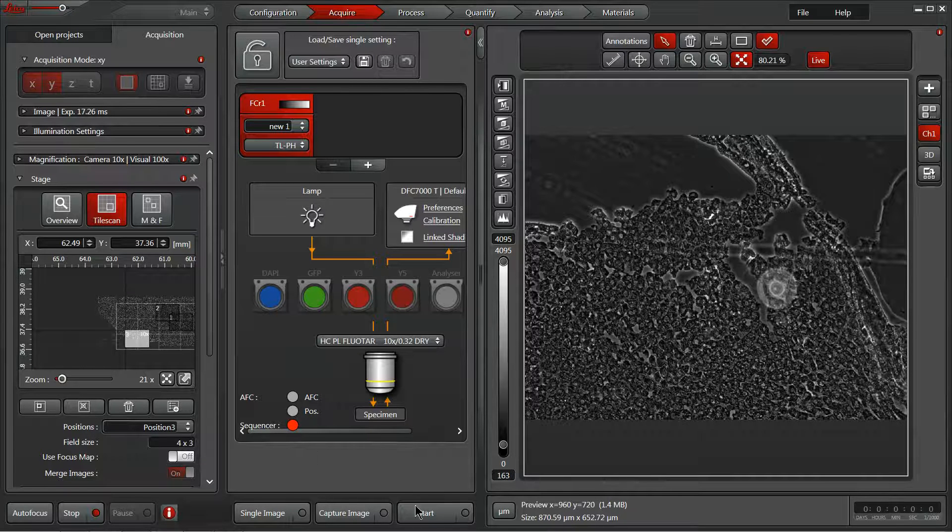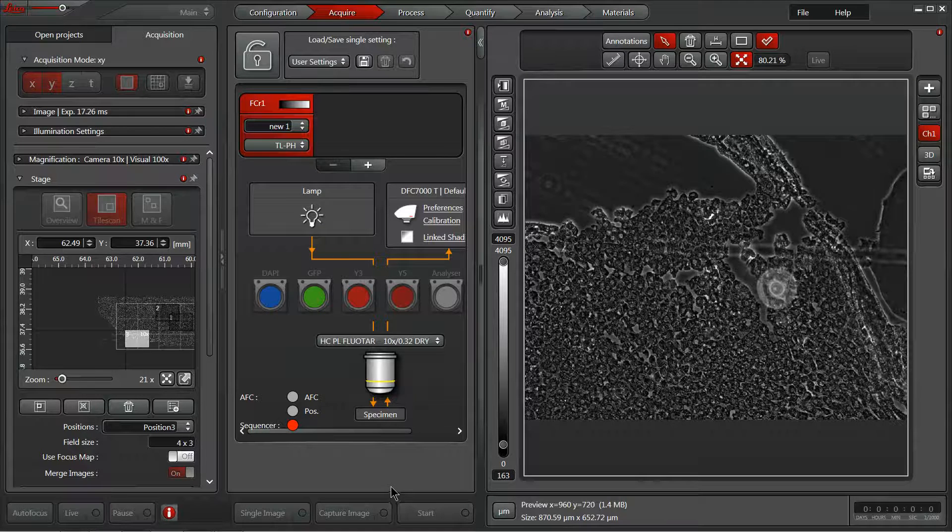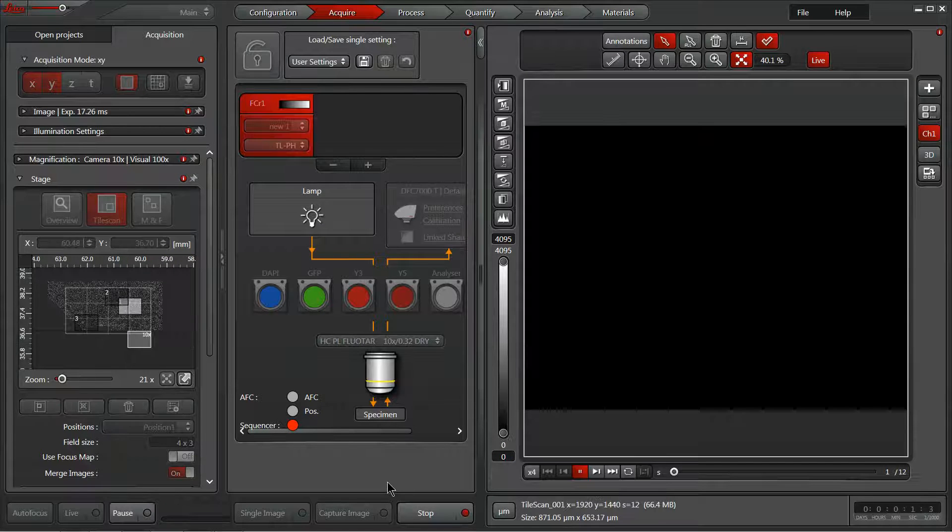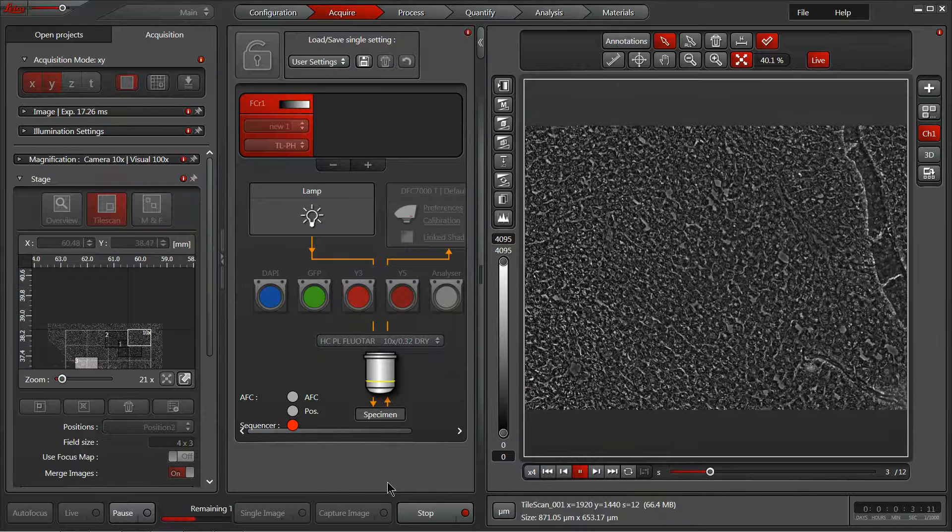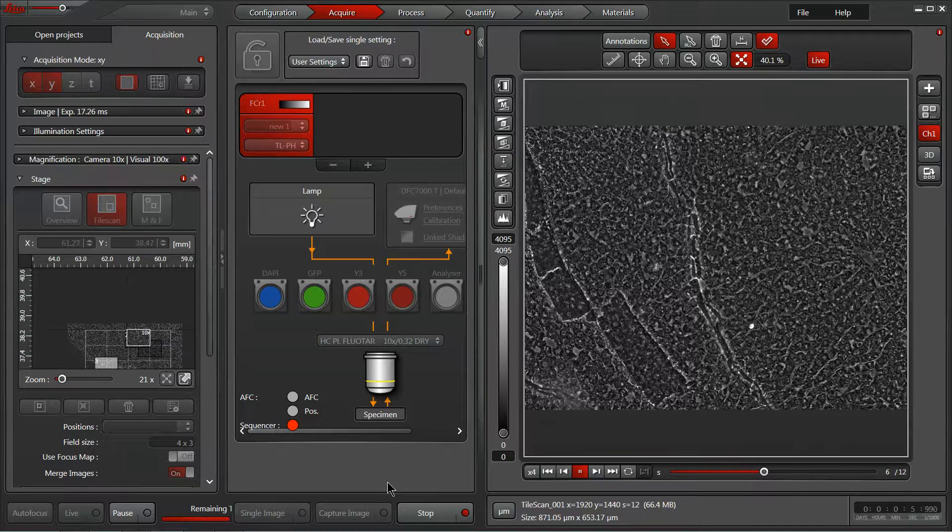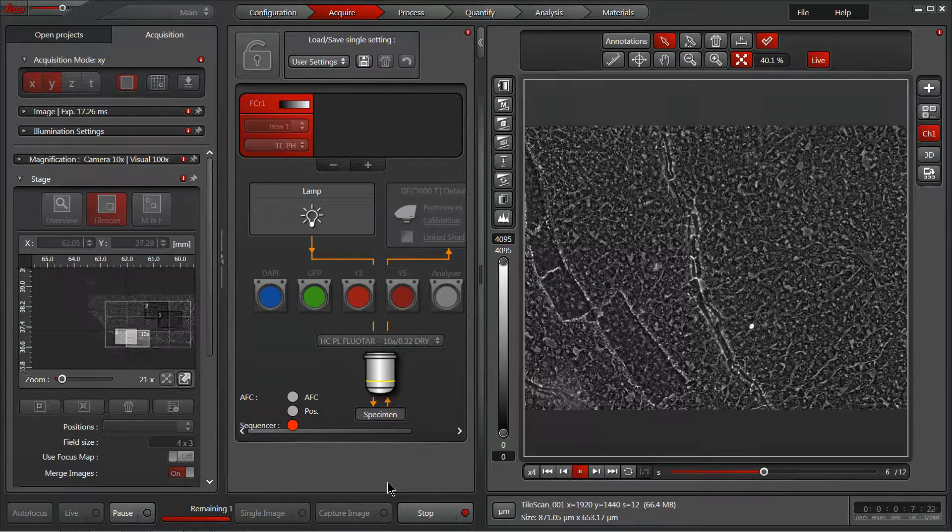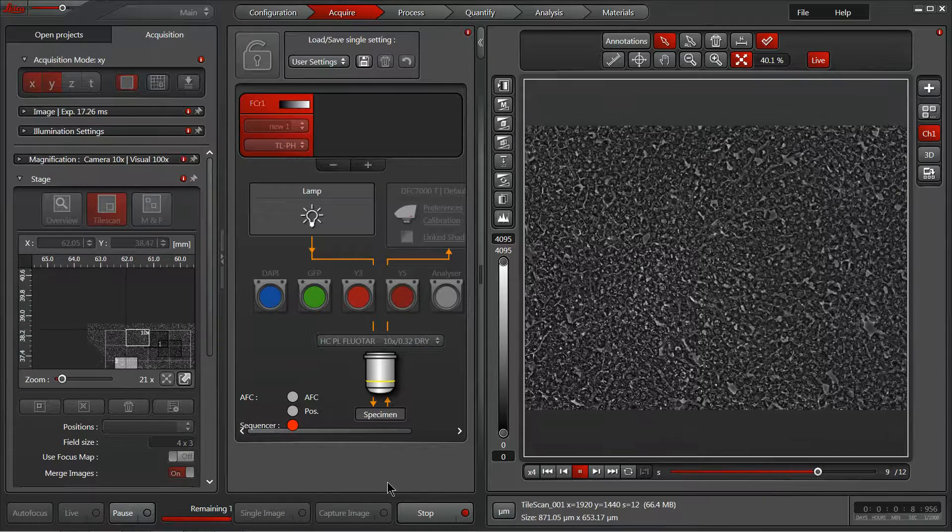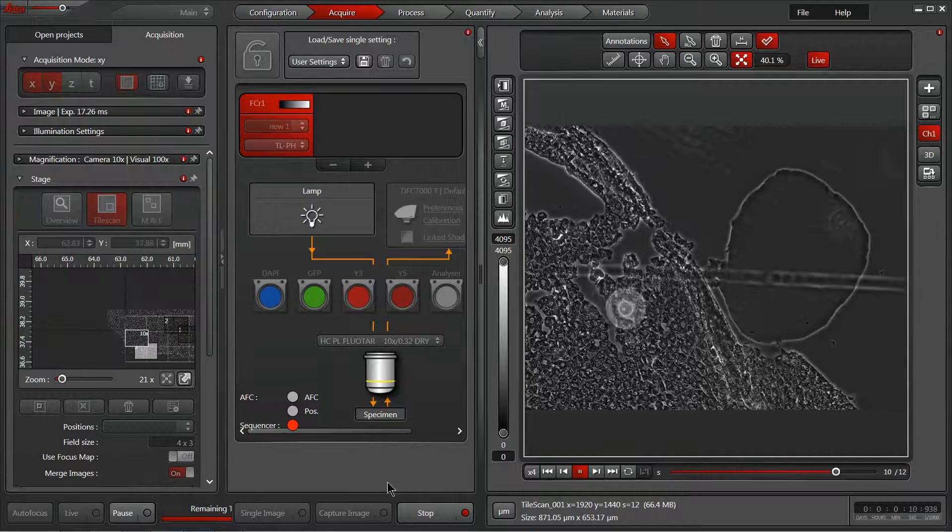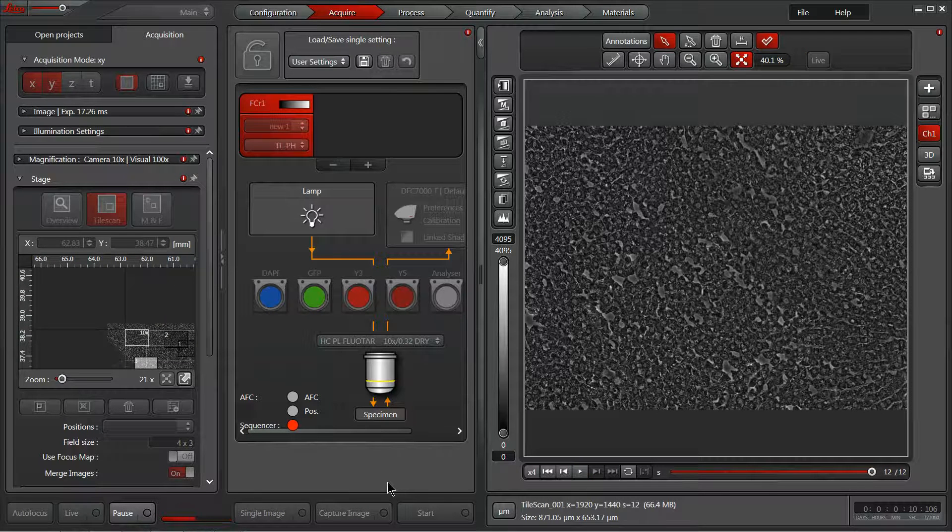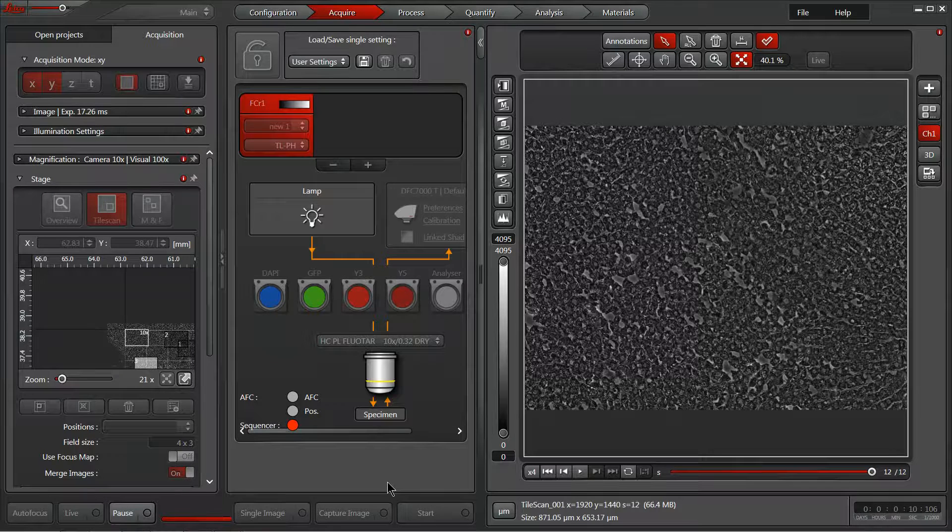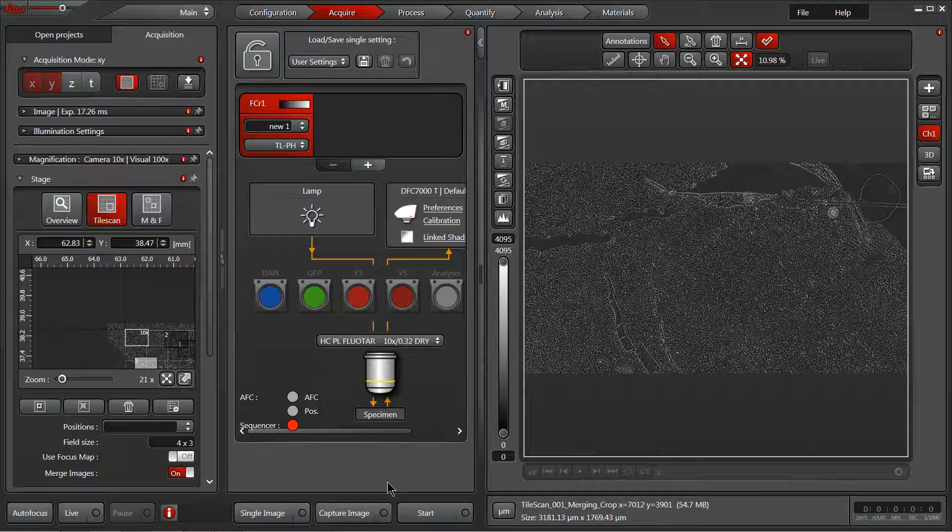With all our positions selected, we can go ahead and hit start. The acquisition will begin. So the system will quickly move through and image each of these positions. You can control how much is overlapping. So if you aren't getting the appropriate quality of stitch at the end, you can increase that overlap to try to give yourself some more information to work with.